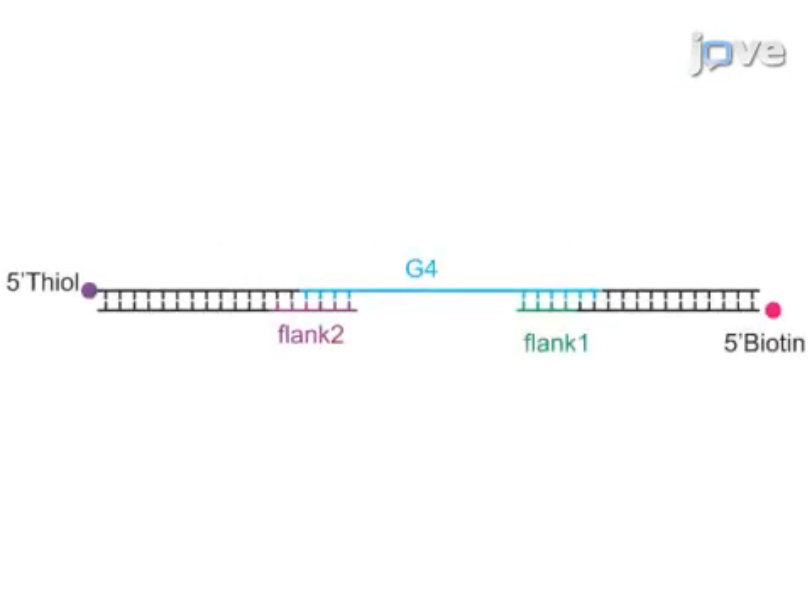Begin this procedure with preparation of G4 DNA in the flow channel as described in the text protocol. G4 DNA was prepared by ligating G4-forming single-stranded DNA, two-flank single-stranded DNA, and a double-stranded DNA handle using T4 DNA ligase.